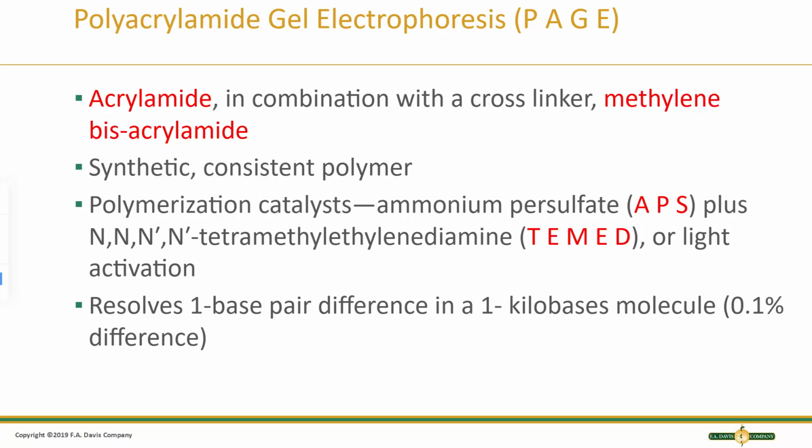Not only are they separated by size, but they're also separated by charge. So if you run a gel in a certain pH environment, it will run one way, and if you run a gel in a different pH environment, it'll run a different way, because proteins and their side chains all kind of work in a different way. So that's kind of the next level. We're just kind of focusing on DNA and how we would separate strands of nucleic acids out on a gel.